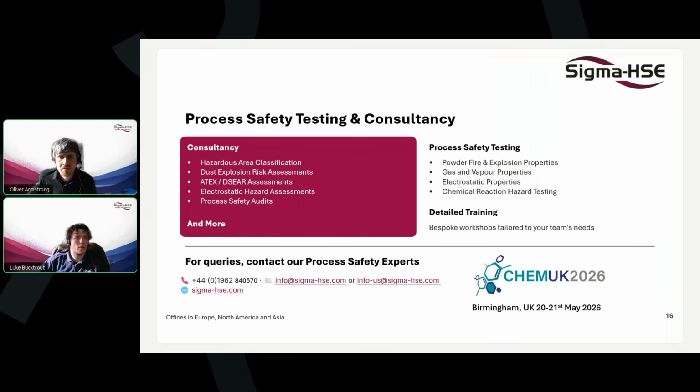Thanks, Nick. We've got another one here. What are the minimum requirements for DSC to be used for safety measurements?